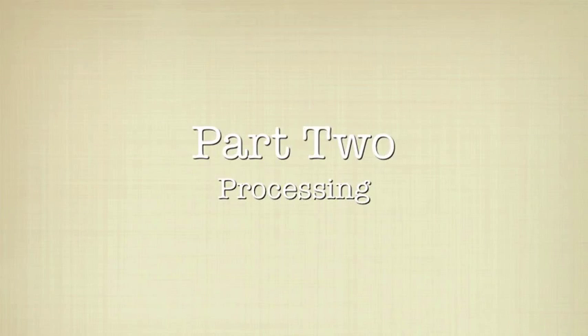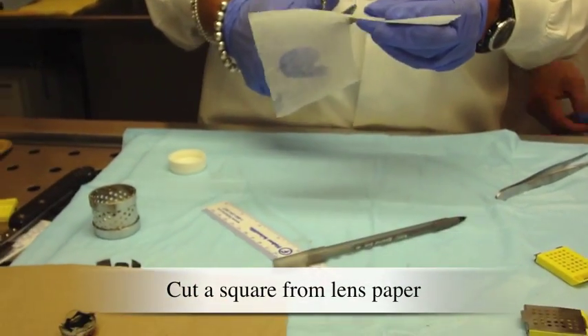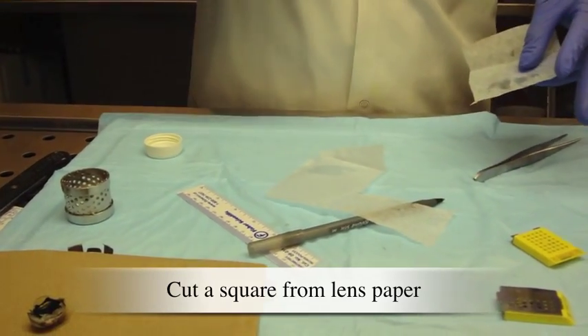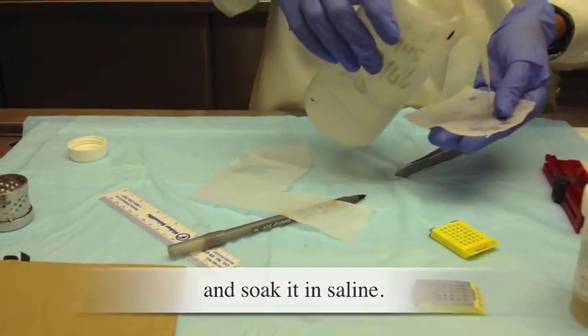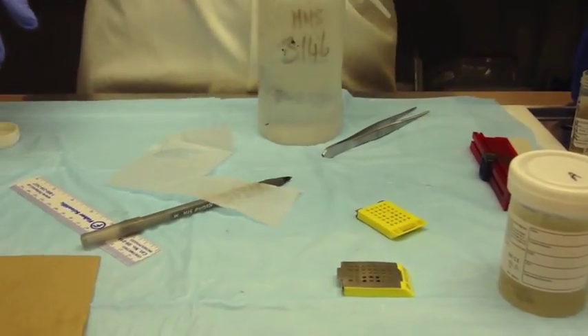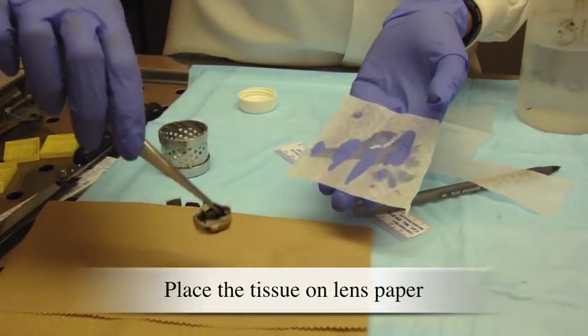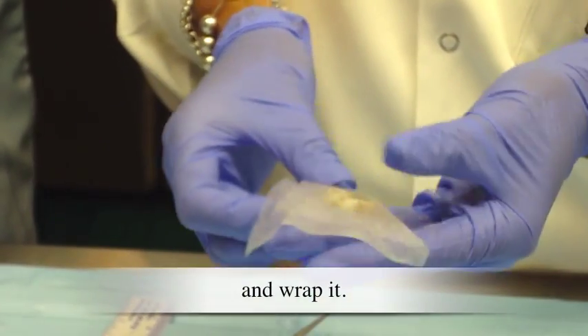Part 2: Processing. Cut a square from lens paper and soak it in saline. Place the tissue on lens paper and wrap it.